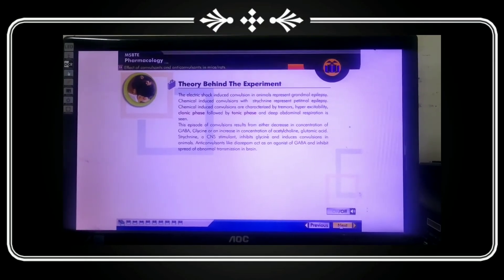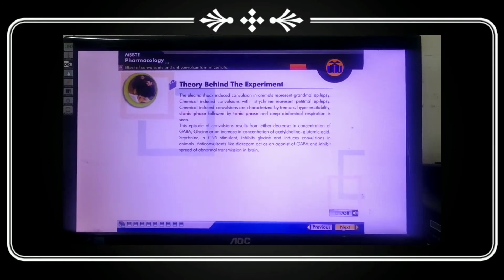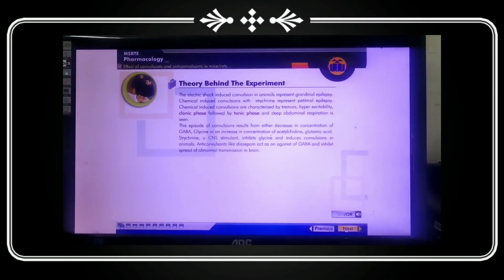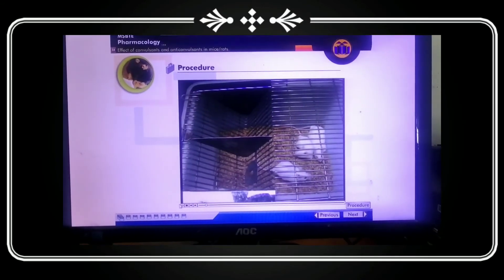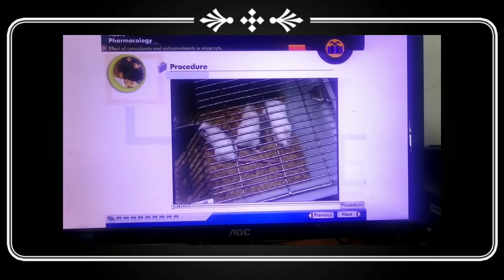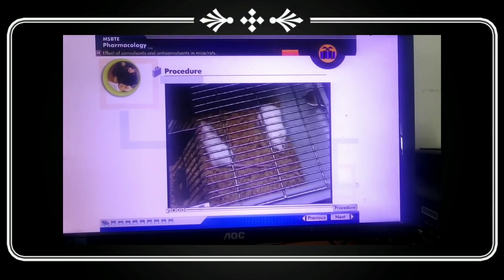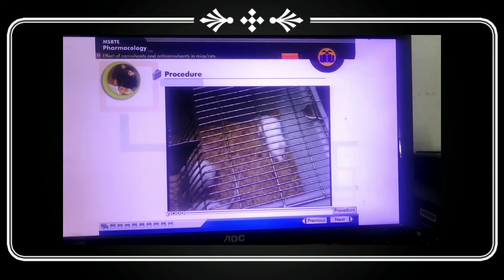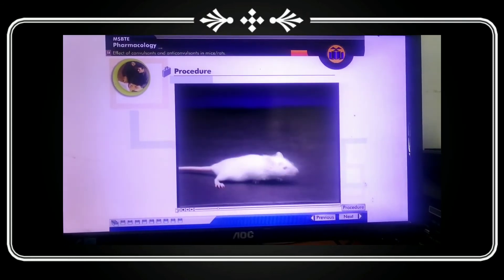With the help of this experimental animal model, we can check the activity of convulsant and anti-convulsant drugs. We will observe with the help of this video experiment, which is a demonstration. We will see how the convulsion is produced and how, after giving the anti-convulsant, the convulsion is relieved.